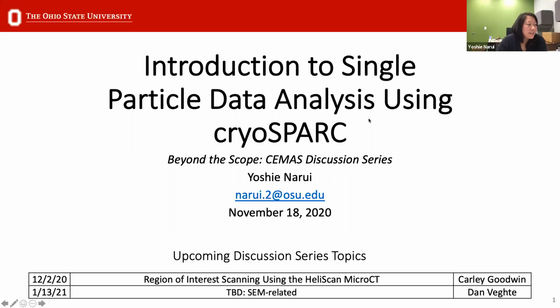Okay, thanks for the introduction. As Dan mentioned, I'm part of the Cryo-EM team here at CEMAS. As a preface, the target audience for this talk would be people that have not ever done any single particle data analysis before. So if you've used CryoSPARC or RELION before, I'm not sure how terribly helpful it'll be, but this is meant to be purely an introduction for beginners.